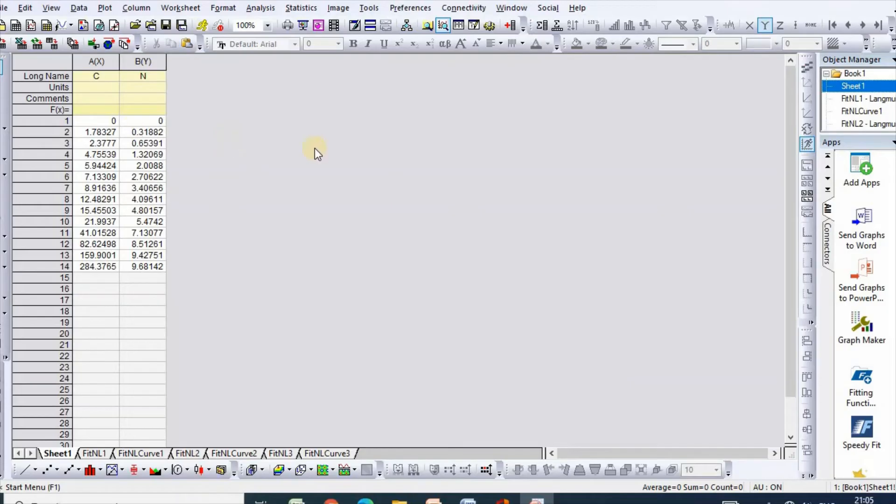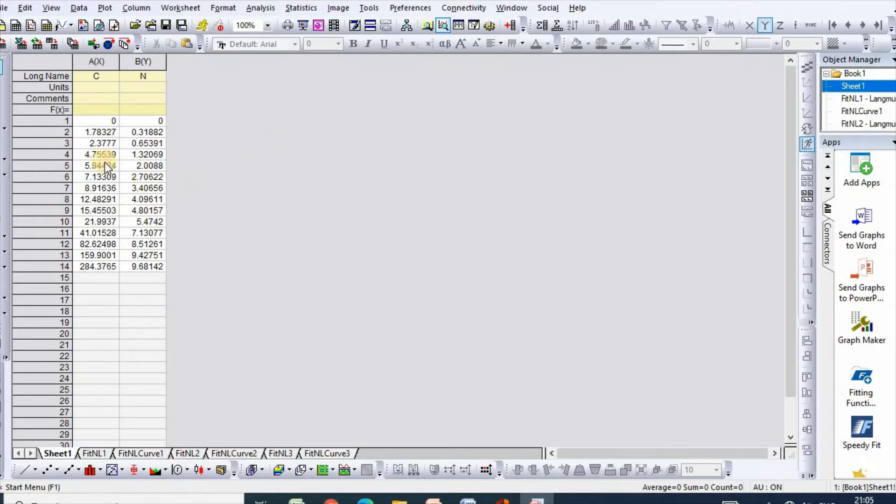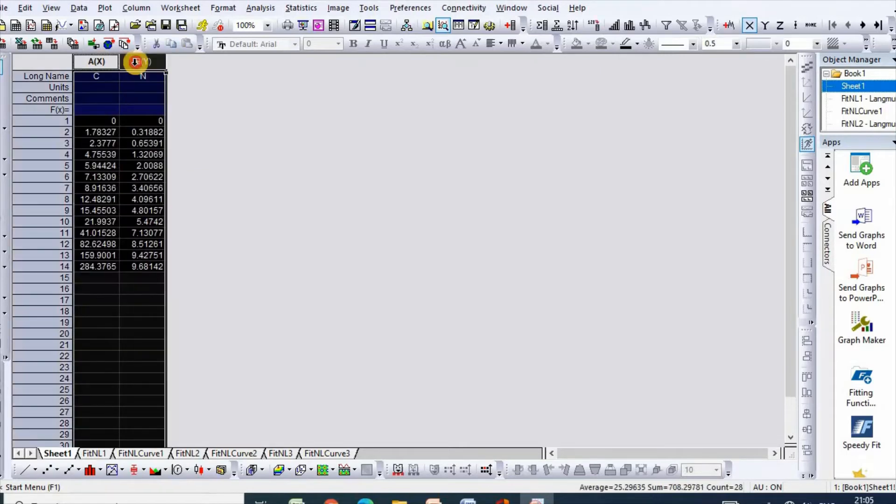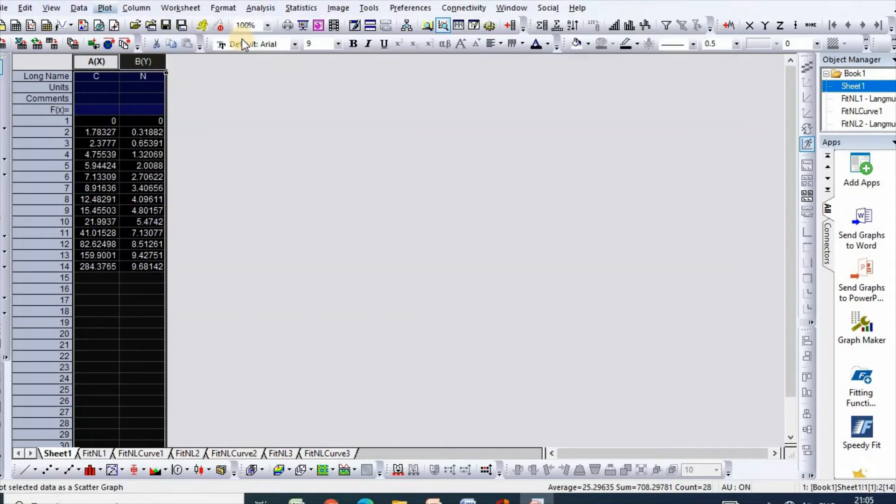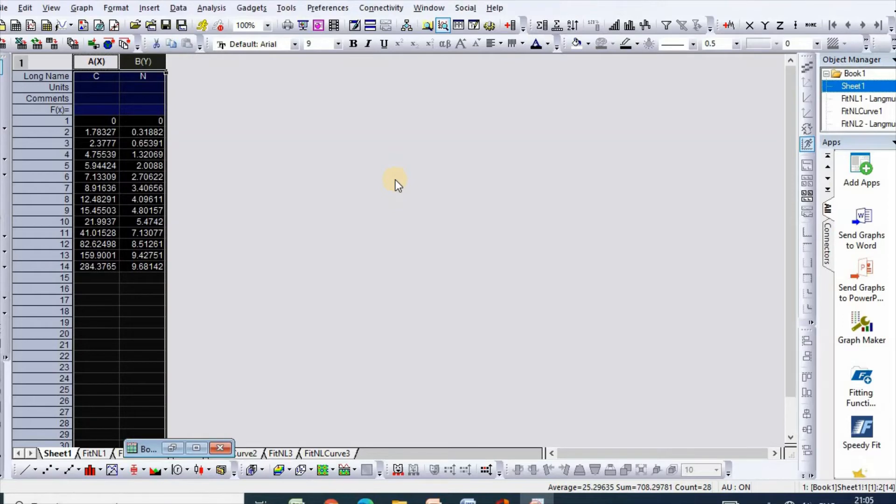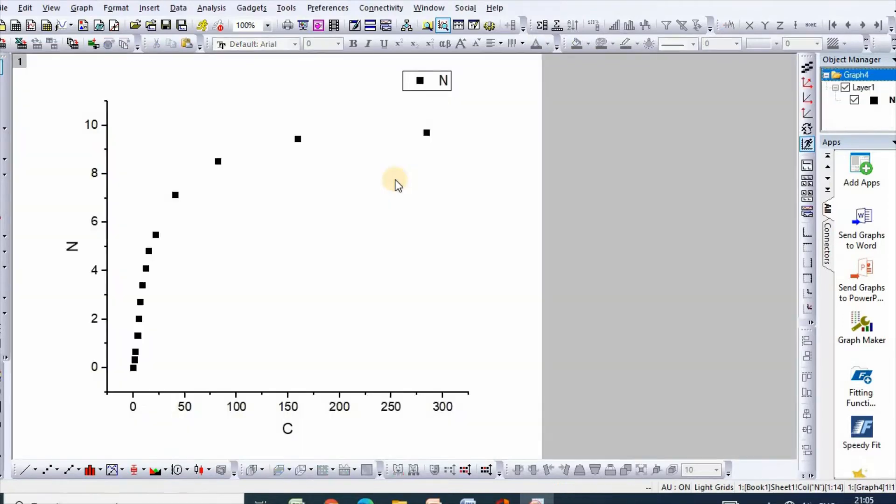In order to fit RP isotherm model, I have taken my data from Excel sheet to Origin sheet, then select, click plot, then scatter. Here is your isotherm.